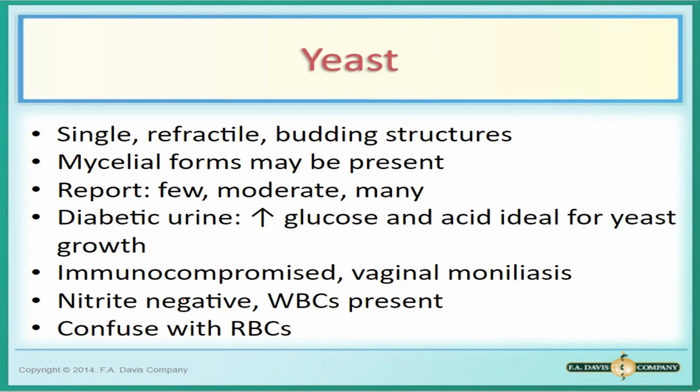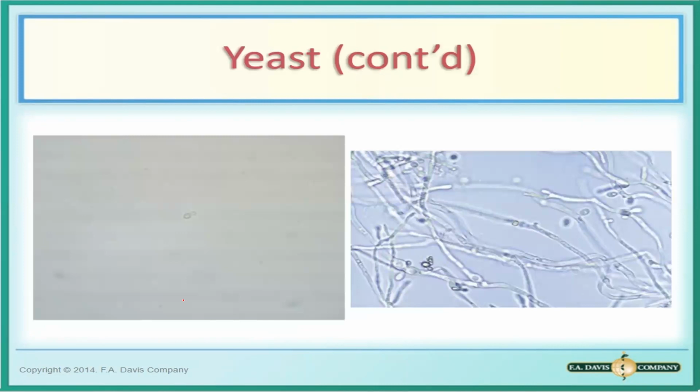Parasites. Sorry. This is your yeast pala. Again, kapag mukha siyang RBC, di ba? Just look for the budding structure niya. Just look for yung buds. Magkakadikit siya. And this one is called, ito yung mycelial form or hyphae na form ng yeast. Okay.